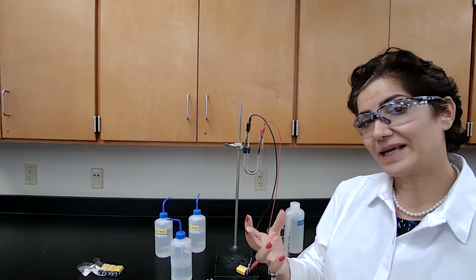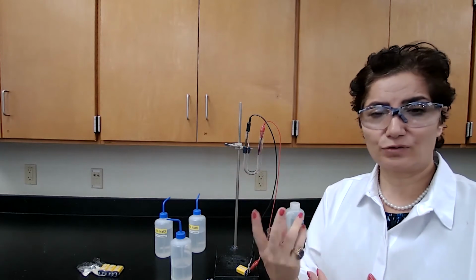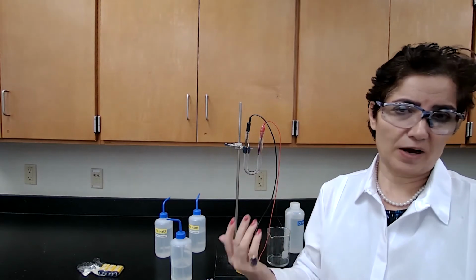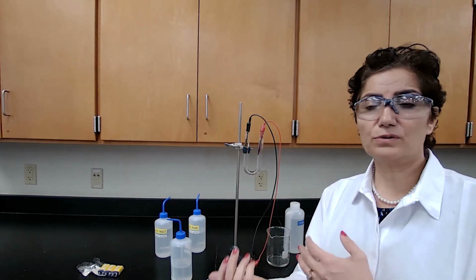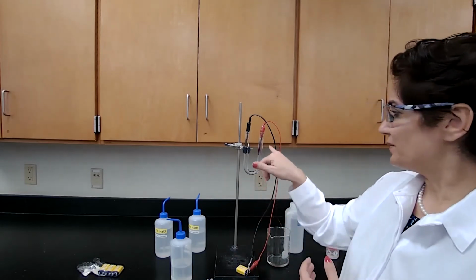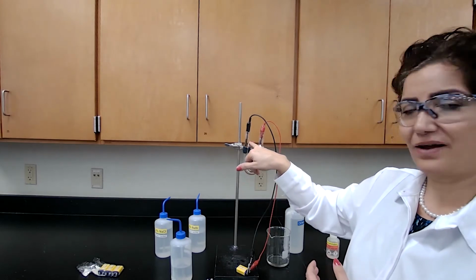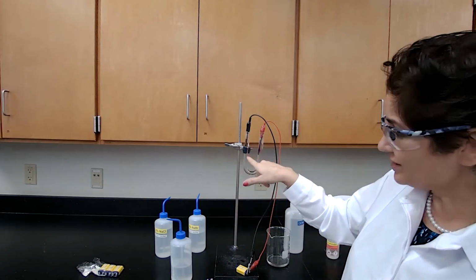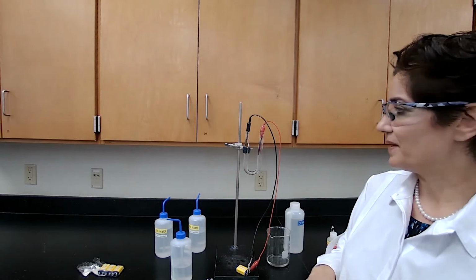The choices again for the anode side, for the oxidation, we have two choices. One is iodide ion being oxidized to iodine. The other one is water losing electrons and producing hydrogen ion. Because we already have water being reduced, I don't have to worry about water being oxidized as well. But I also see that yellow color appear on the anode side.